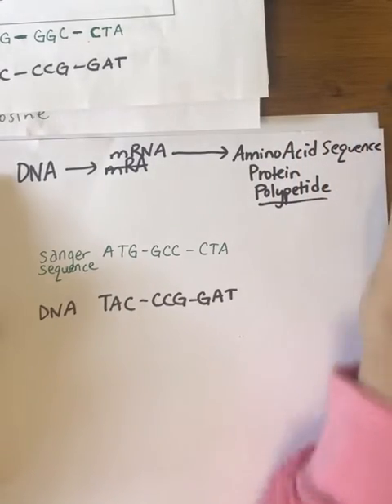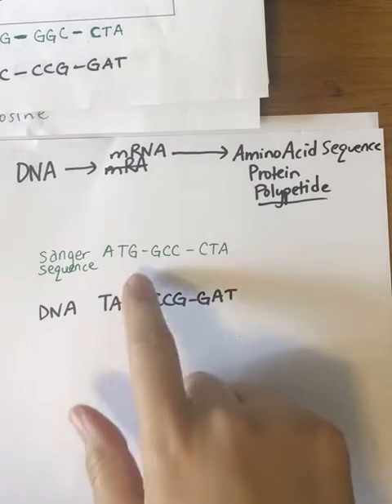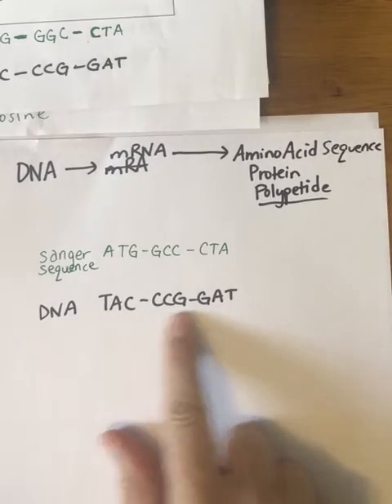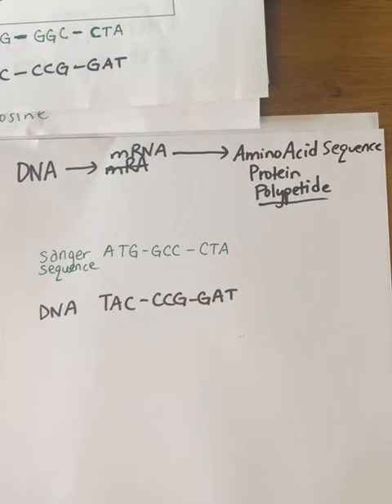So in lab, you're basically going to use your Sanger sequence to figure out your DNA. Now, the next step in lab, and it's a question on there, it says figure out the Sanger sequence, then it says to figure out the DNA. The next question is to determine the mRNA by matching the nitrogen bases to your sequence. So I'm giving my original example here.